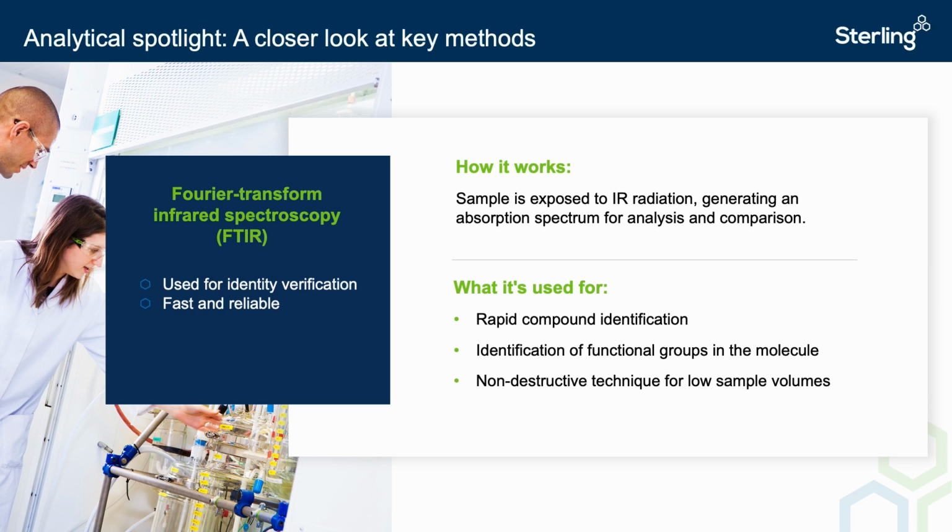This technique is also desirable if there isn't a lot of sample available, as you only need a few milligrams, and it is not destructive, so if you need to reuse your sample, you could. The newer units for FTIRs are also quite small and only need a laptop to accompany them, an easy benchtop technique. Sample analysis is also quite quick. Turnaround times vary depending on your method, but usually do not take more than a few minutes.